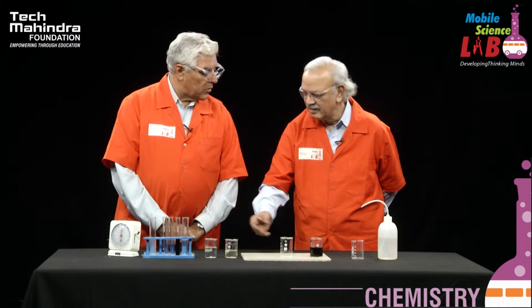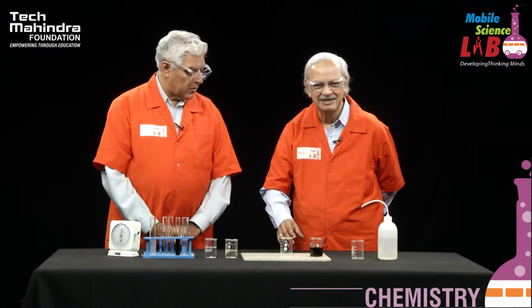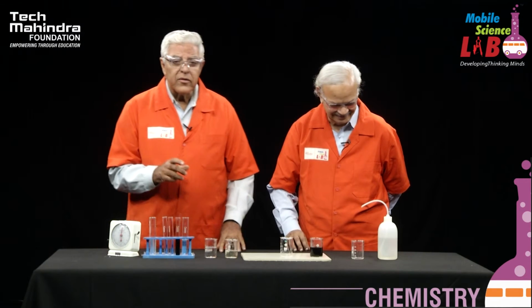More concentration of hypo and all that, we can get it in 25 seconds, 10 seconds. 61 seconds is not a standard one. We can make it faster or slower. And with this simple clock device, known as clock reaction, we can have so many aspects studied of basic chemical kinetics. So let me summarize all this, students.